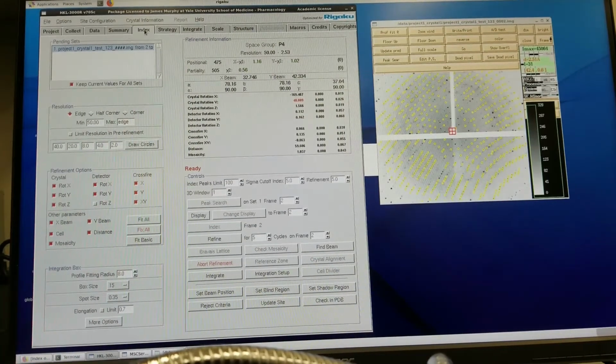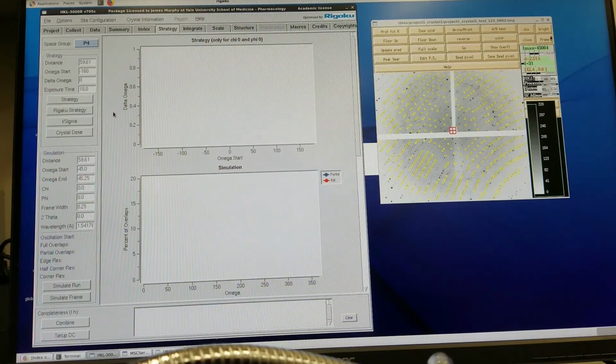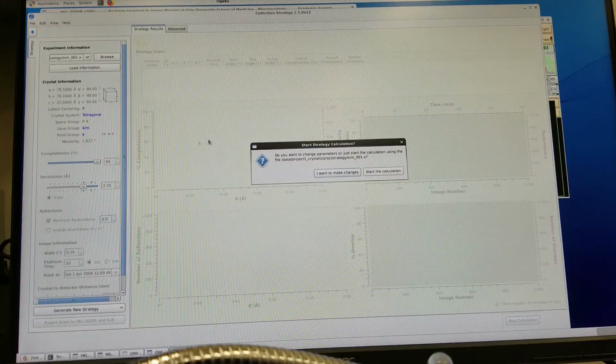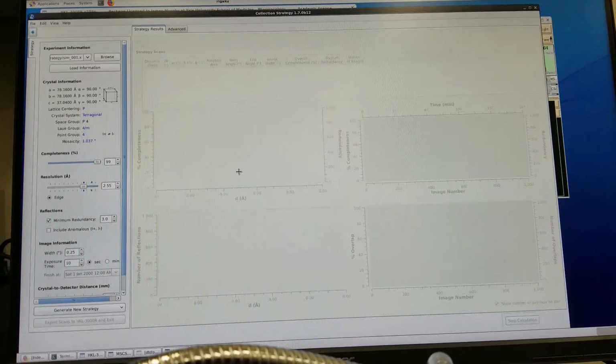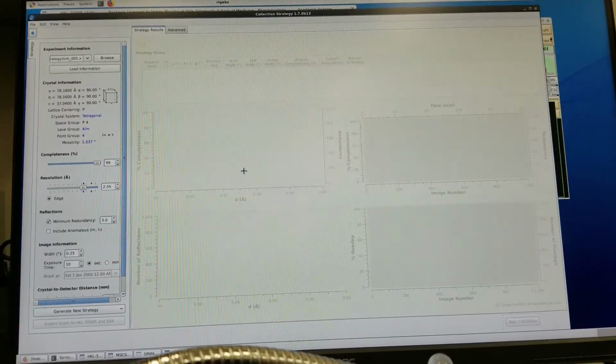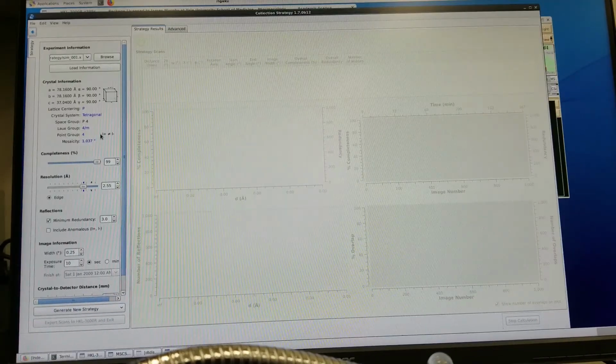So now we'll set up to collect a full data set based on the indexing of the initial image. So we're going to use the Rigaku strategy program here. And what this does, basically the concept is, if you index the first frame, you can then predict where all the spots are going to be, regardless of how you move the crystal or the detector or anything. It's just a mathematical prediction. So software is going to allow us to come up with a collection strategy to collect what we want.